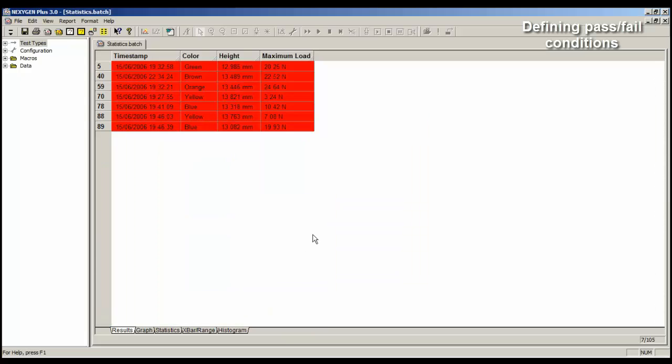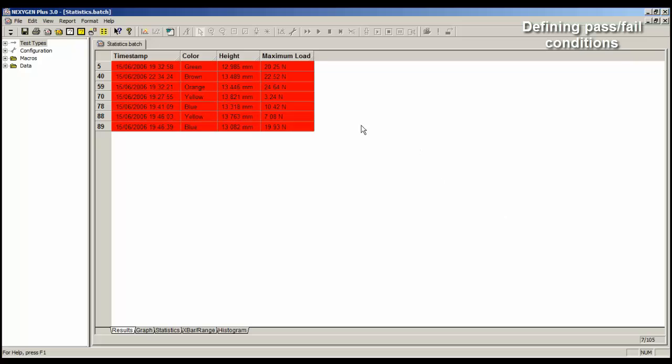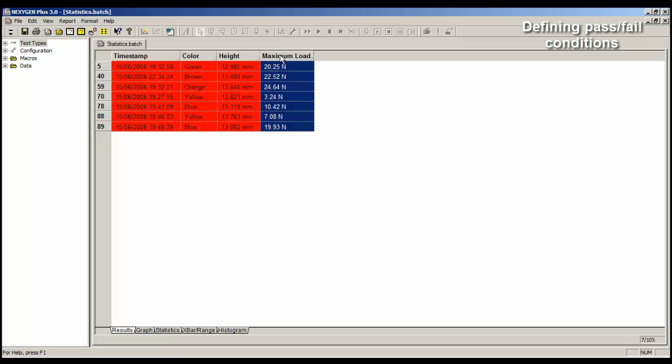And now the data table is filtered. If we look down the bottom right-hand corner of the screen, it's showing me that we're looking at 7 of the tests out of a total of 105. Let's look at the maximum load values, and if we look down here, we can see that all of the values are below our minimum requirement of 25 Newtons. Some are very low.